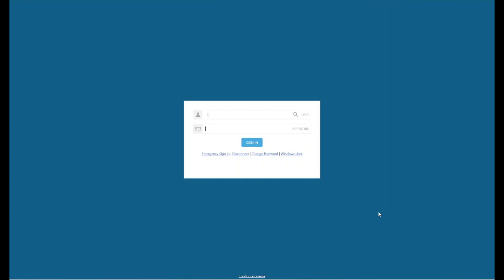When you do purchase the Phoretics 1D image analysis software with the TotalLab GXP module, or in fact any of our software with the GXP option, you will first have this login user interface, which is part of the regulations required for 21 CFR.